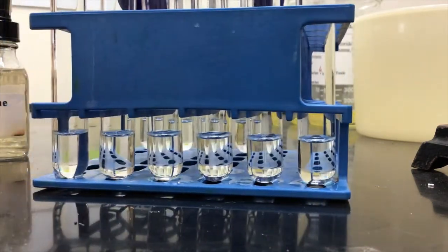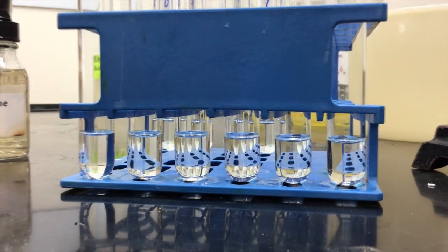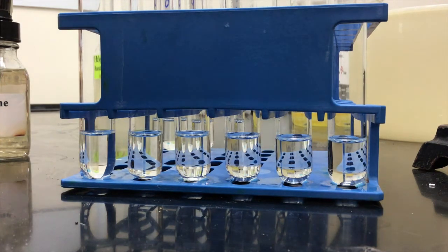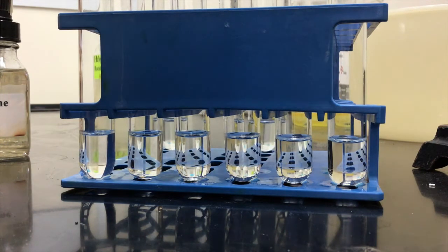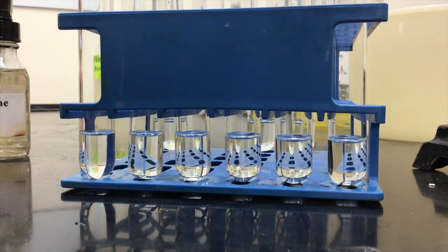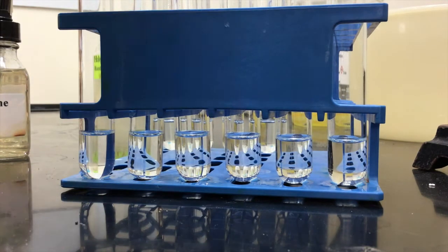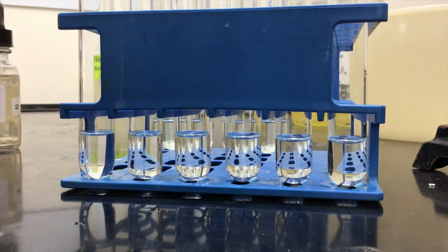Okay, so let's see, was there anything else that I wanted to add? No, I don't think so. So, there were also leaving groups that I wanted to see if you paid attention to in terms of classifying the rate of reactivity. Okay, so now what we're going to do is quickly and carefully move through these reactions. Sorry, I'm getting organized. All right, again, this is number 1, so I'm going to add 4 drops to it. You keep an eye on it.